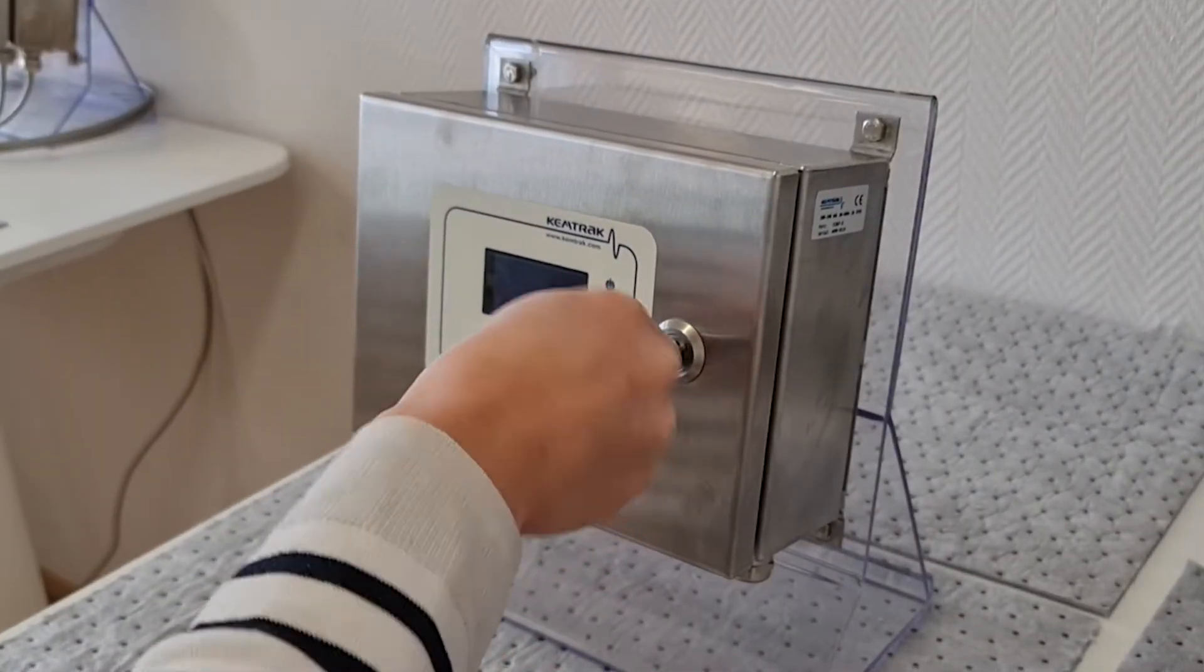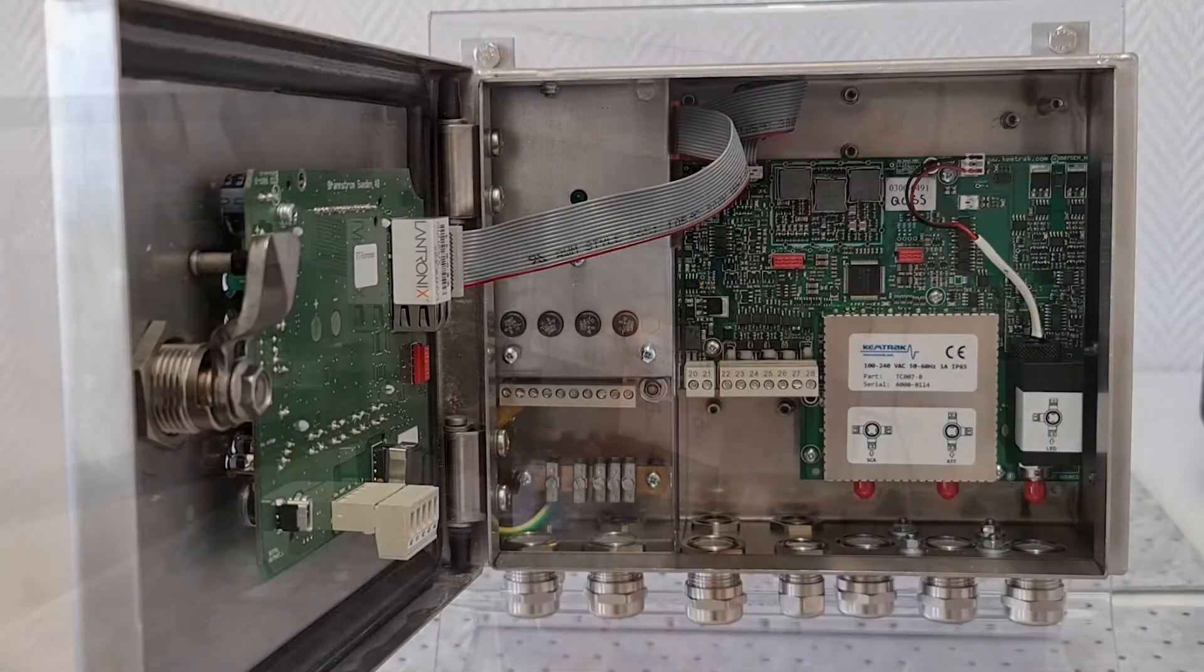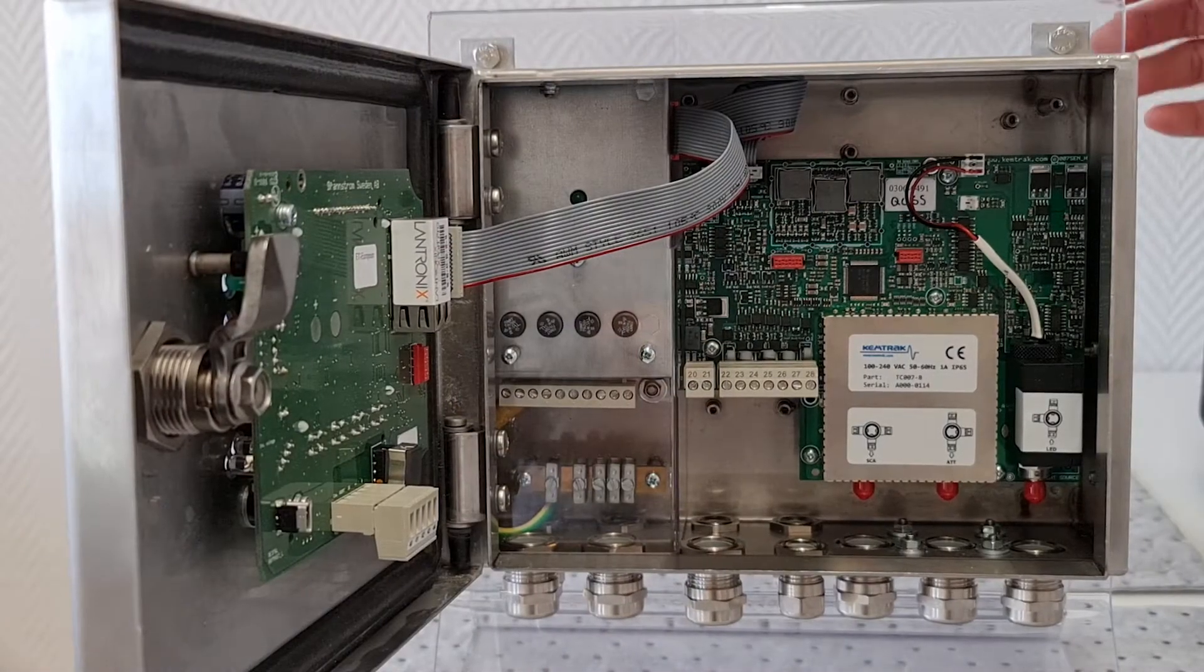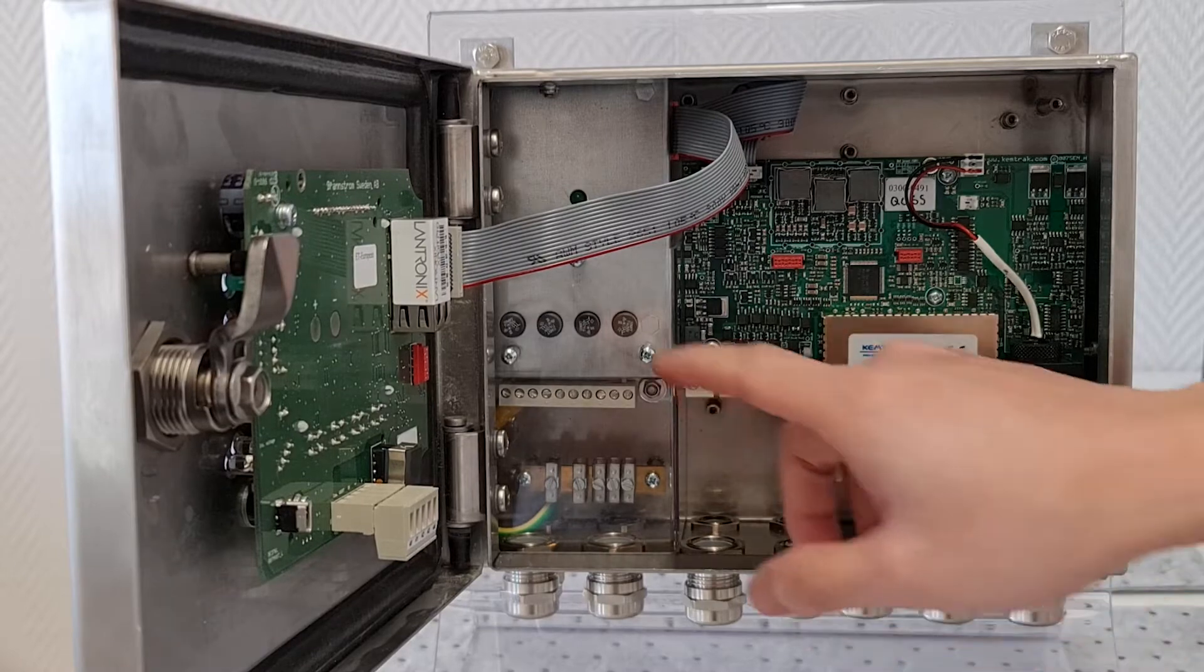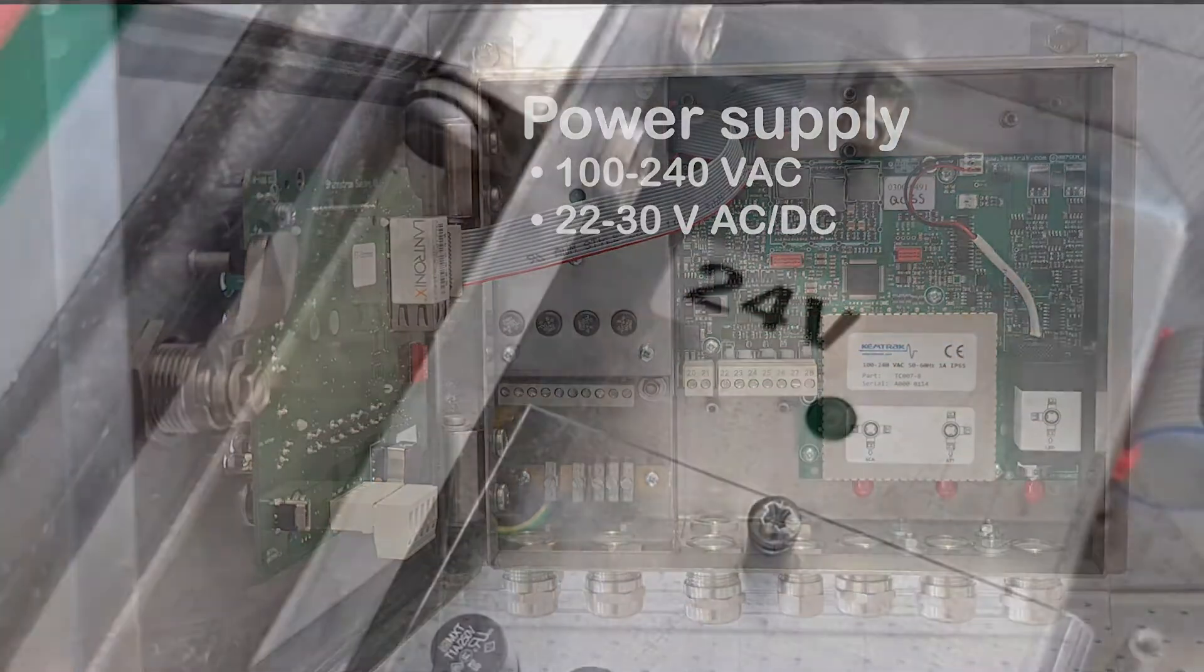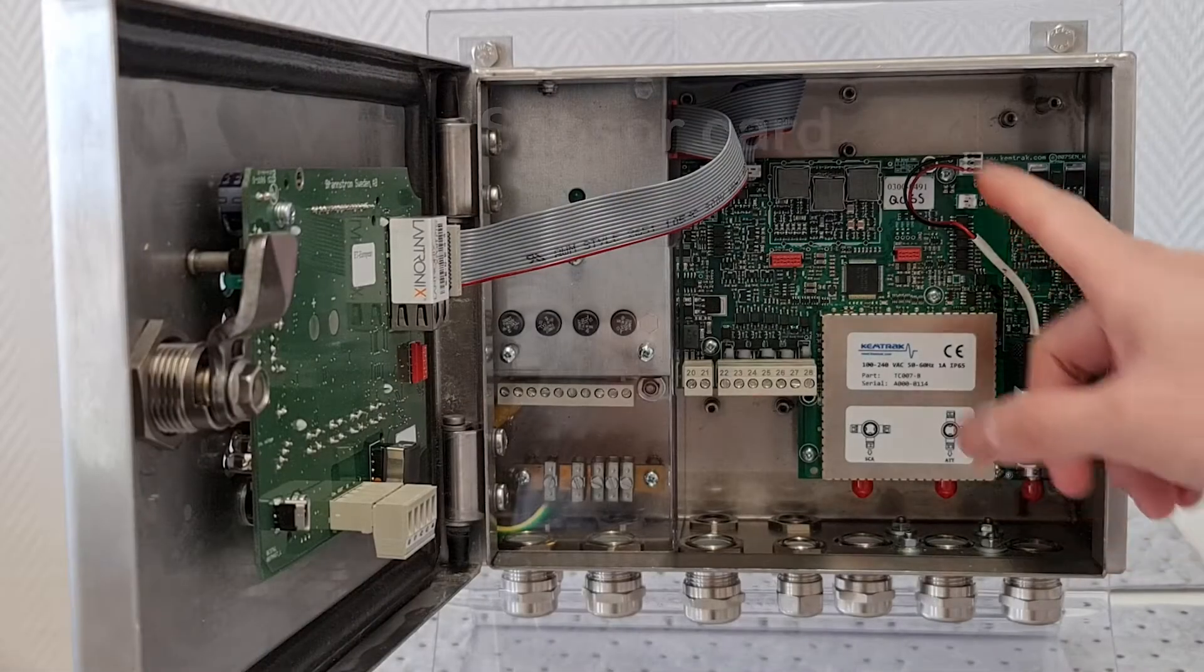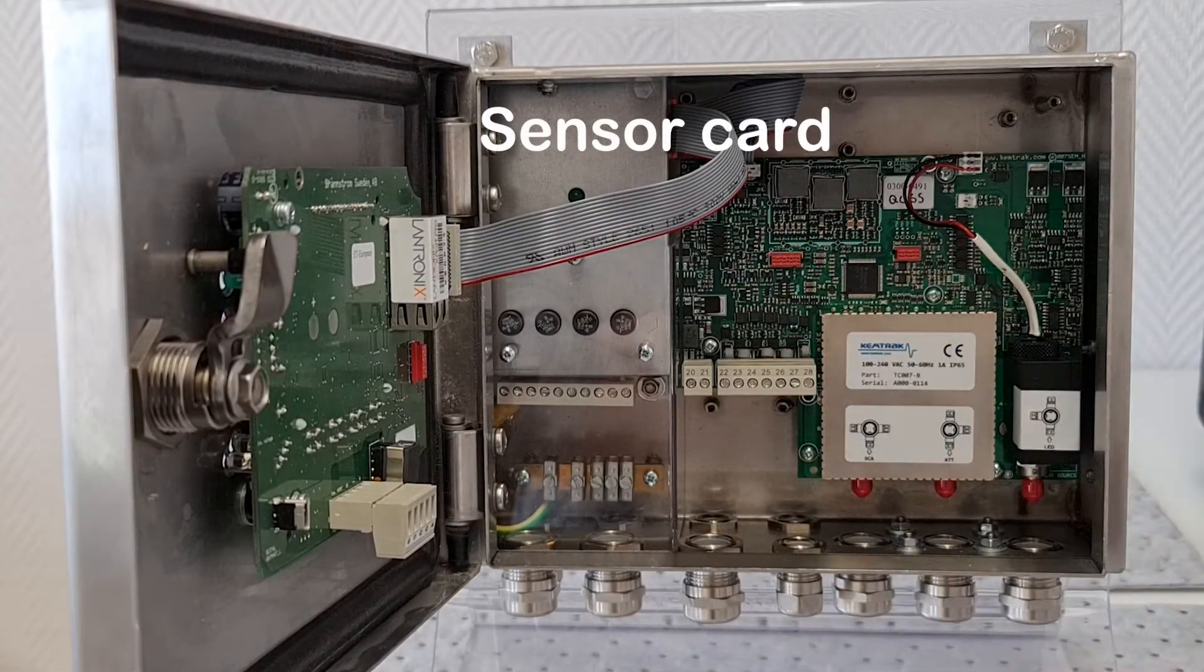Open the analyzer enclosure using the key included and we will begin by familiarizing ourselves with the various components of the analyzer. The power supply unit is located on the left side and is available in two models. The sensor card is what performs the optical measurements.